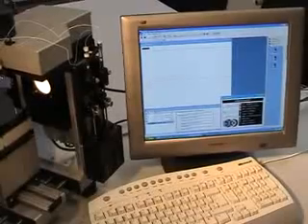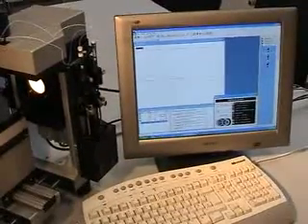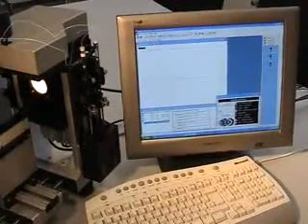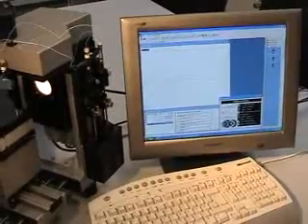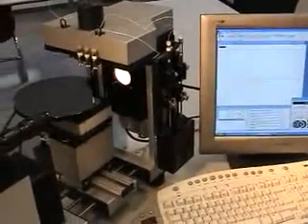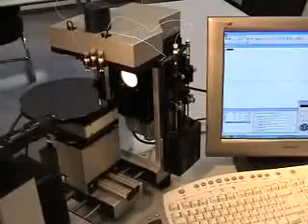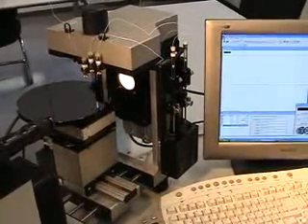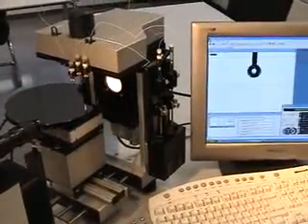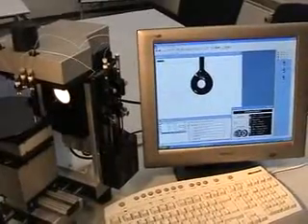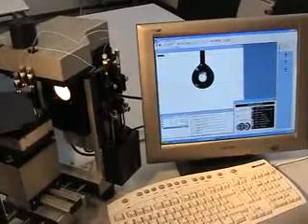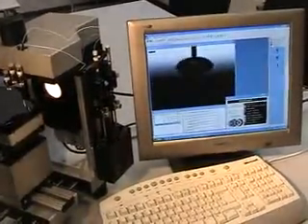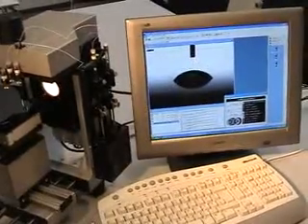Depending on our definition, it can be that within a few minutes we have already mapped the complete wafer. We have no interaction by the user, so it is completely free of influence of human errors.